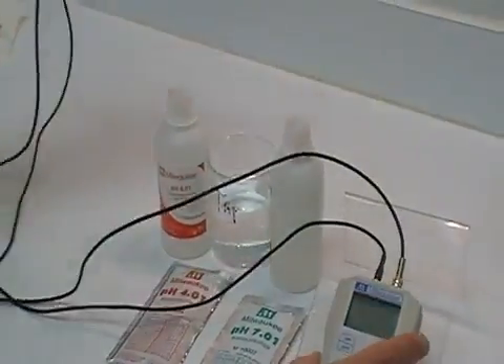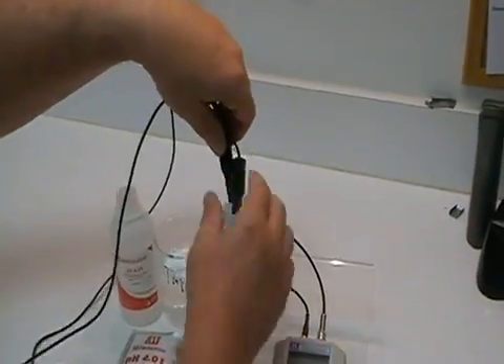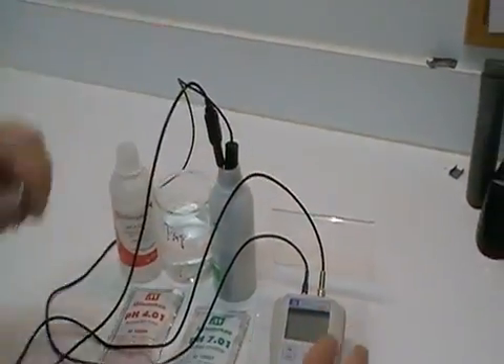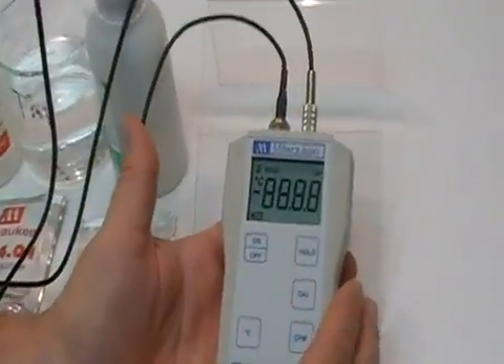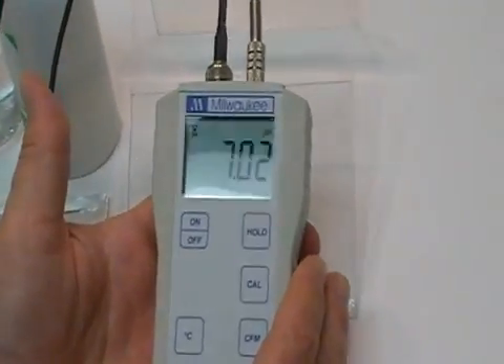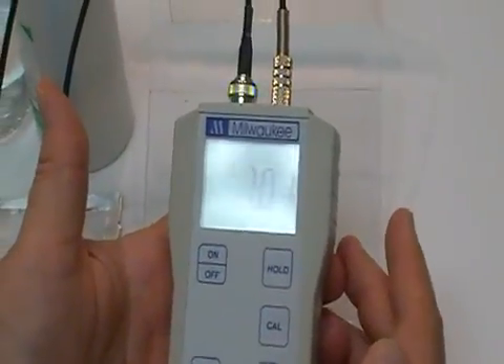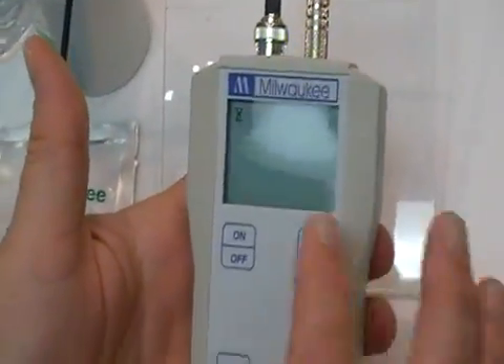So, to get started, we're going to insert the pH probe and the temperature probe together into the calibration standard that we have and turn the unit on. Then go into the calibration mode by hitting the CAL button — you're going to see the flashing.